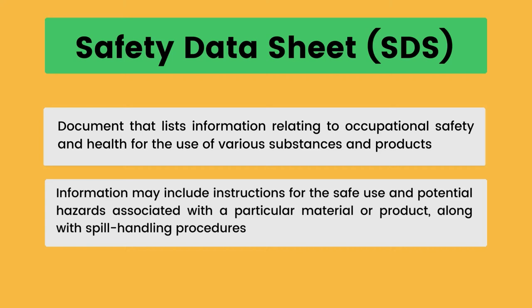SDS need to be revised if there is new information on the hazardous chemical, or if more than 5 years have elapsed since the last date of revision or preparation, or as directed by an officer. SDS should be written in the national language and English.